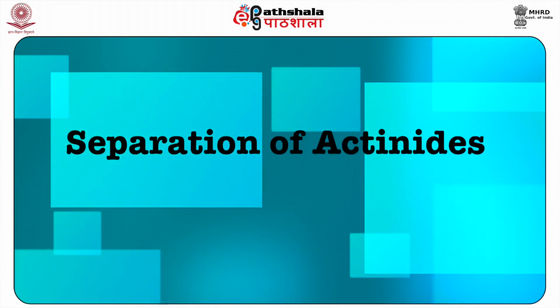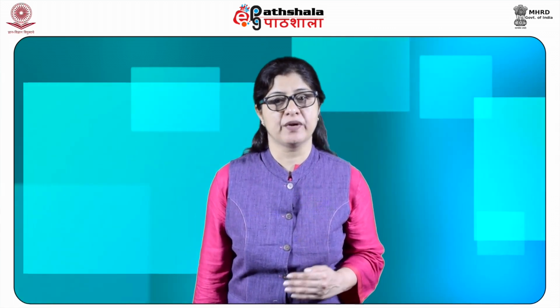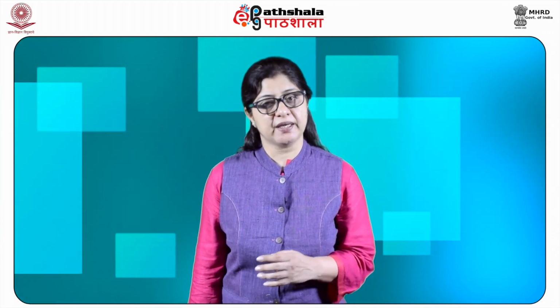Separation of actinides. The ion exchange chromatographic technique has played a unique role in the discovery of trans-plutonium elements in the actinide series. In the actinide series, the elution occurs in the reverse order of the atomic number due to the actinide contraction, and this proved to be the only way for identifying these elements, some of them having been produced only in atom quantities. It may be said that their isolation would have been impossible by any other separation method.